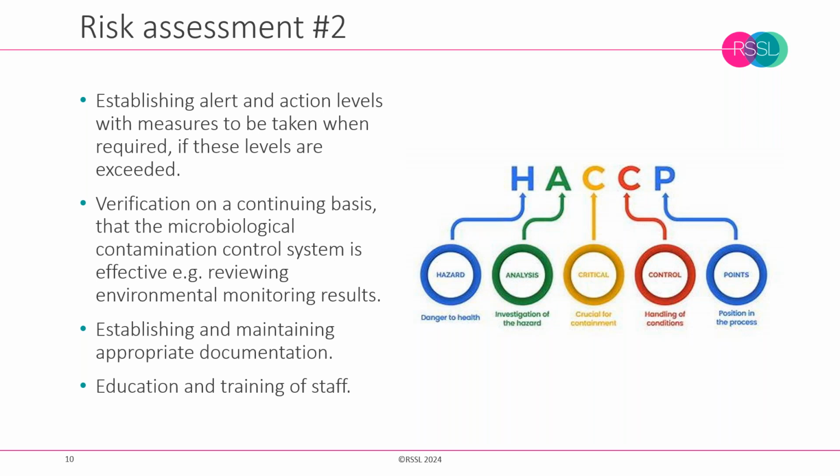It's also important that our environmental monitoring program is dynamic, and something that we can review and adjust accordingly. Within a clean room, production personnel will sometimes move things around, or during periods of shutdown there may be walls knocked down, rooms reconfigured, there may be new processes, new technologies to develop.